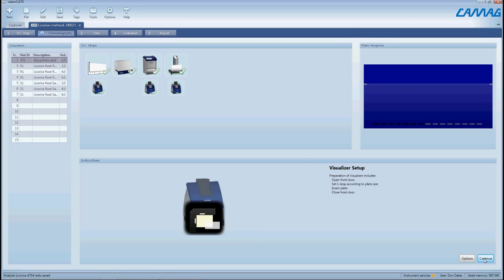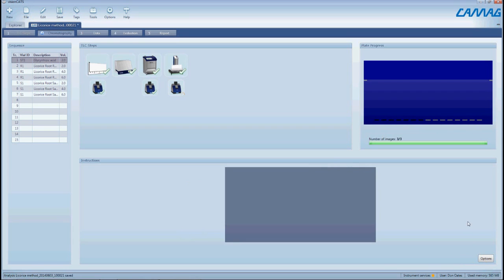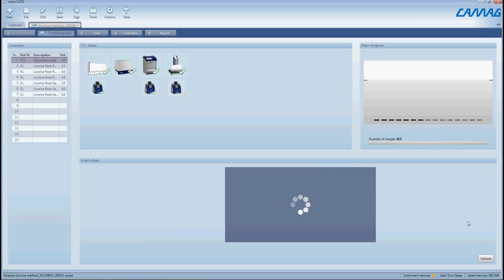So again we're just going to click on continue and as before the visualizer will begin to acquire the images and after each light source the image will show us a preview on screen.